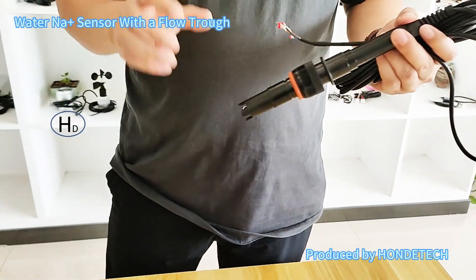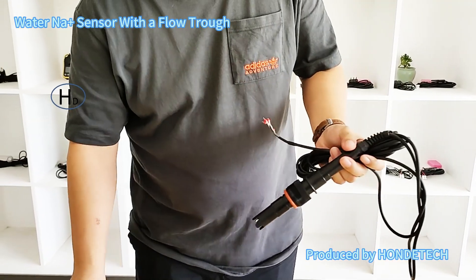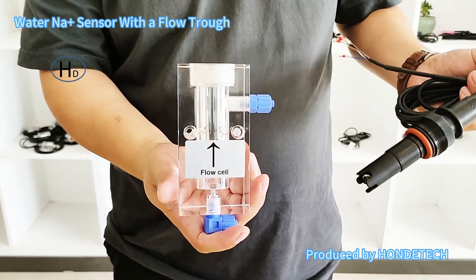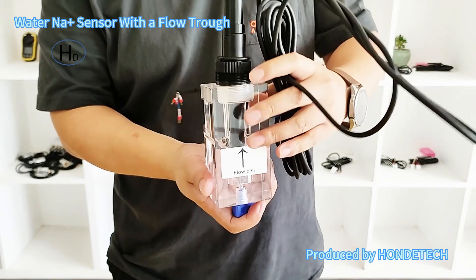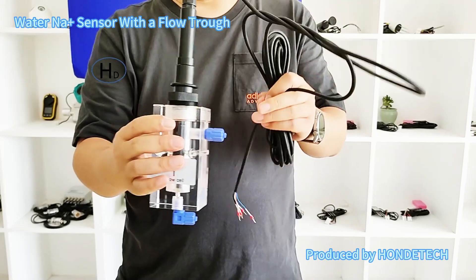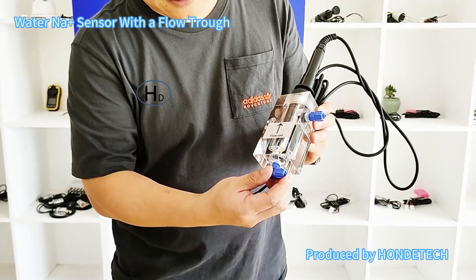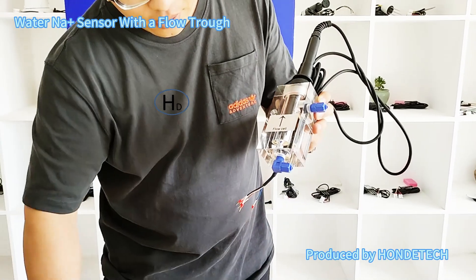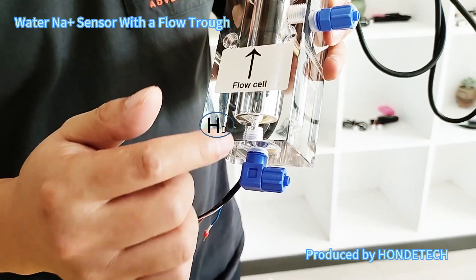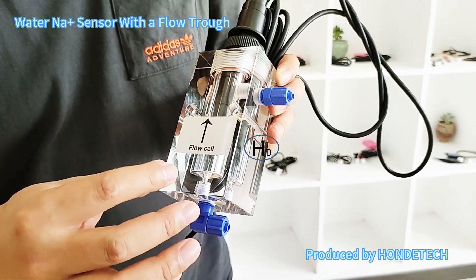For this sensor, as the flow speed will have a big effect on the measurement, we advise you to use the flow cell. If you need, we can also supply the flow cell, and this flow cell can be installed with the sensor. We also have the pipe — there is the water inlet and the water outlet — to control the flow speed and keep it stable.